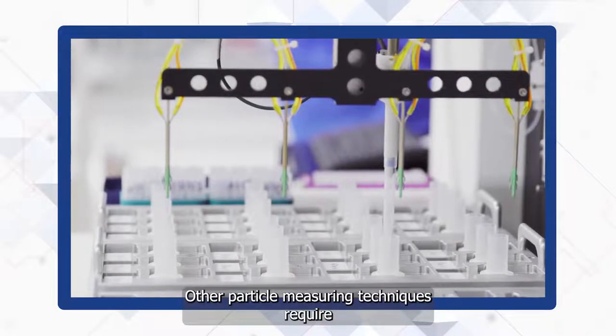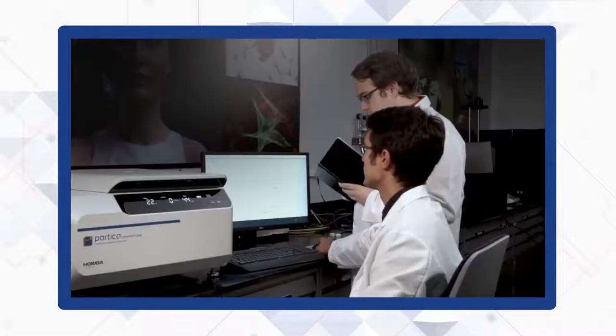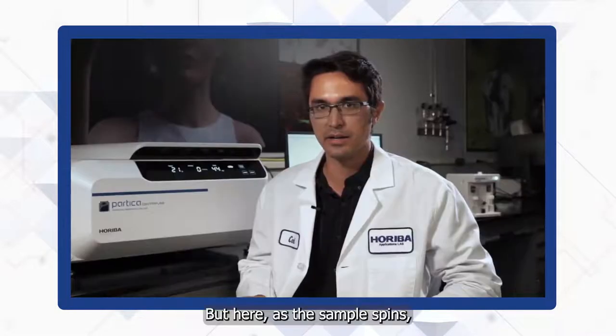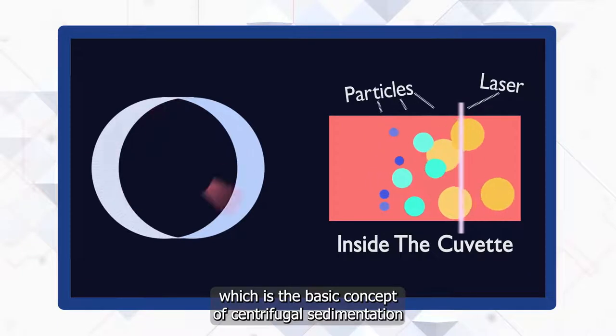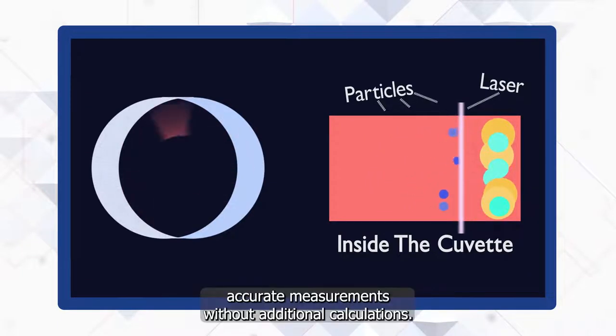Other particle measuring techniques require factoring in assumptions for accurate measurements — Mie theory or Fraunhofer, in the case of laser diffraction. But here, as a sample spins, centrifugal force separates the materials by their density, which is the basic concept of centrifugal sedimentation and the underlying principle that gives the Partica Centrifuge accurate measurements without additional calculations.